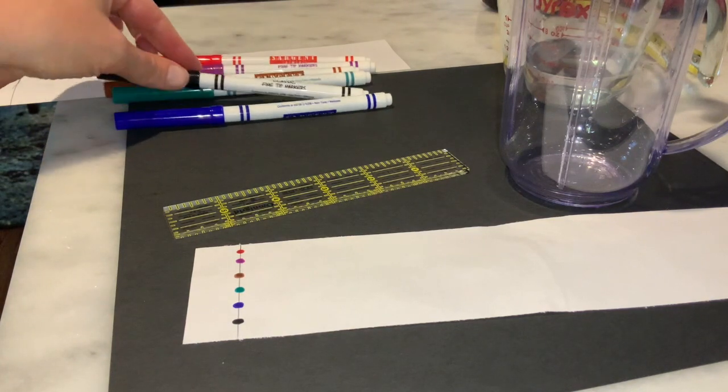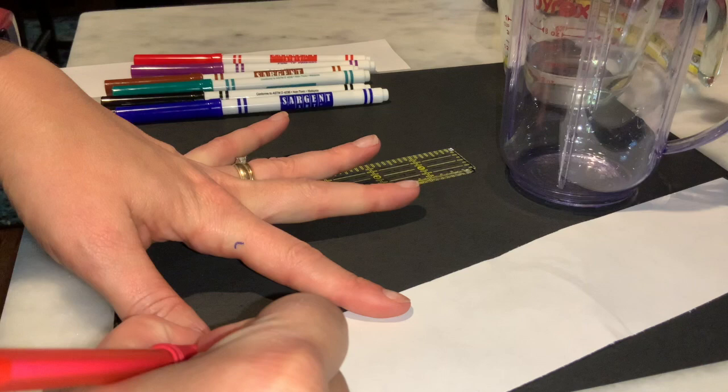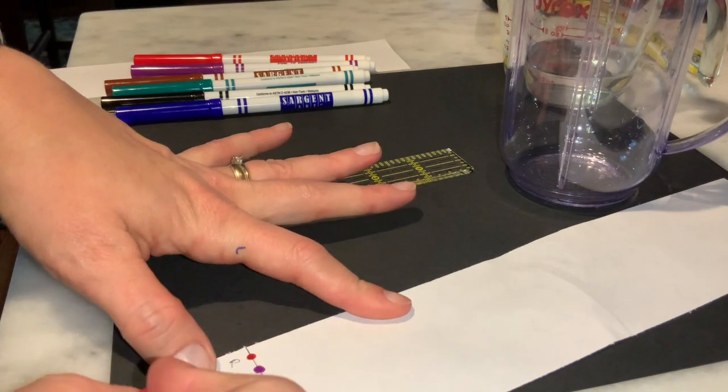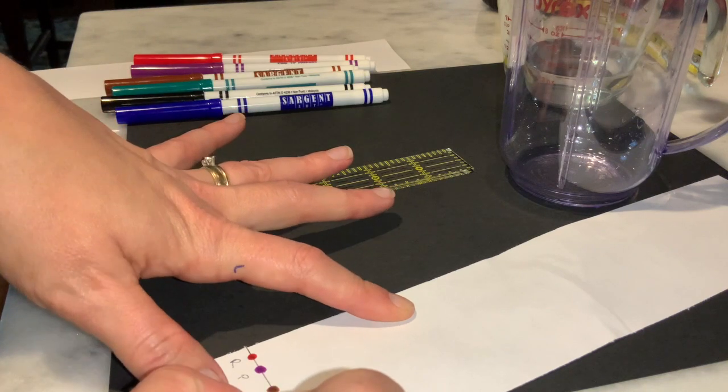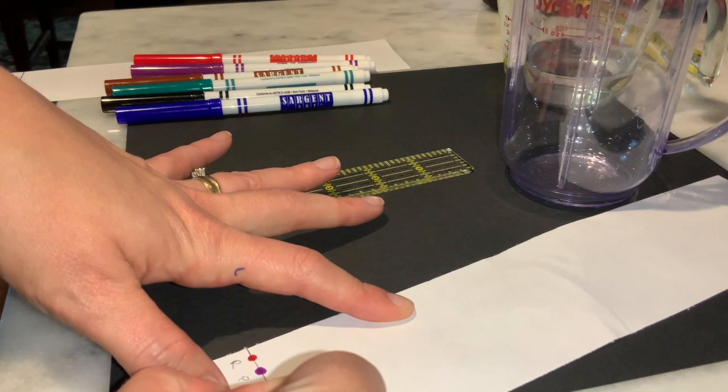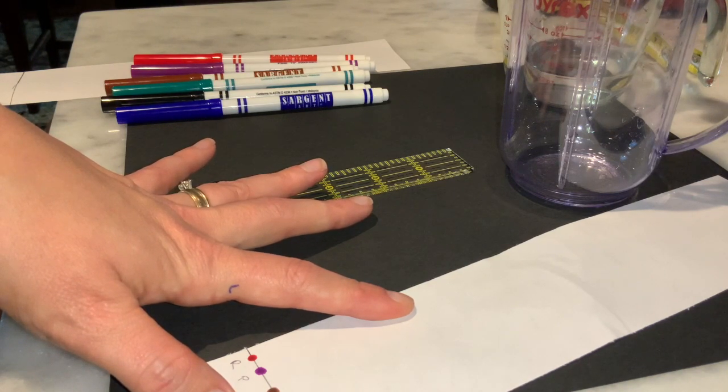Now we want to make sure that we label our samples and we're going to do that in pencil. So I'm going to go in and put an abbreviation. I'm going to do R for red, P for purple, BR for brown, green, blue, and black.